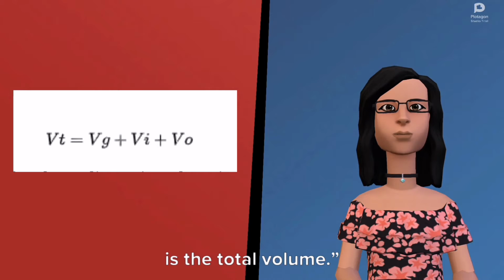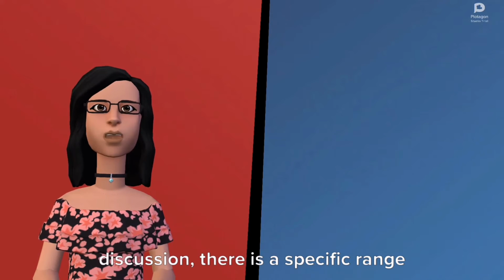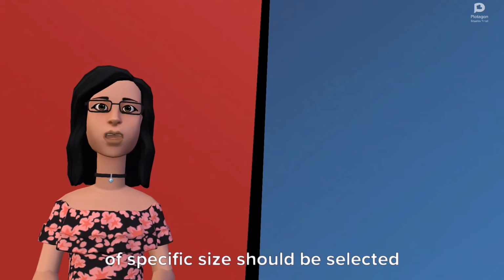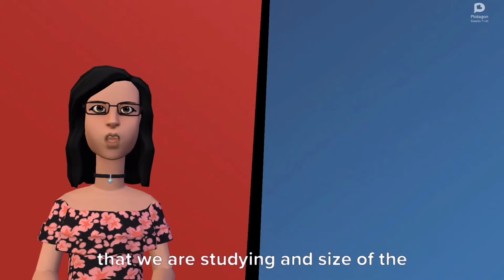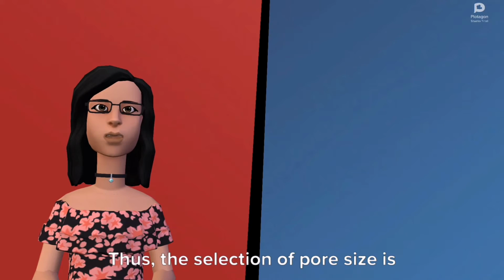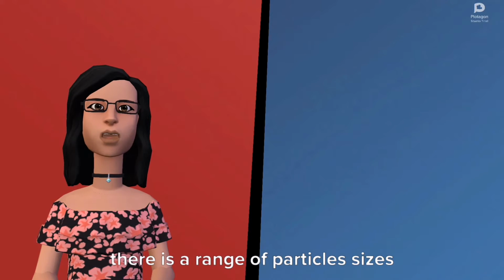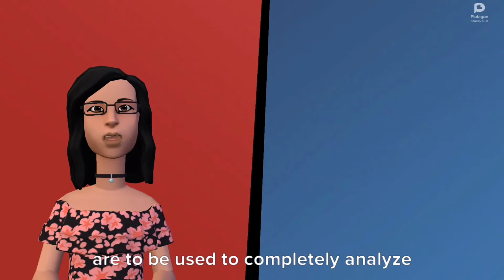The overall volume can be depicted by the resulting equation, in which Vg is the gel's volume and VT is the total volume. As can be seen from the above discussion, there is a specific range that can be separated by a specific column, thus the packing having pores of specific size should be selected according to the weight of the molecules that we are studying and size of the particles that are to be separated. Thus, the selection of pore size is key in doing gel permeation chromatography. One suggestion is that if there is a range of particle sizes in the polymer, then multiple columns are to be used to completely analyze the system.